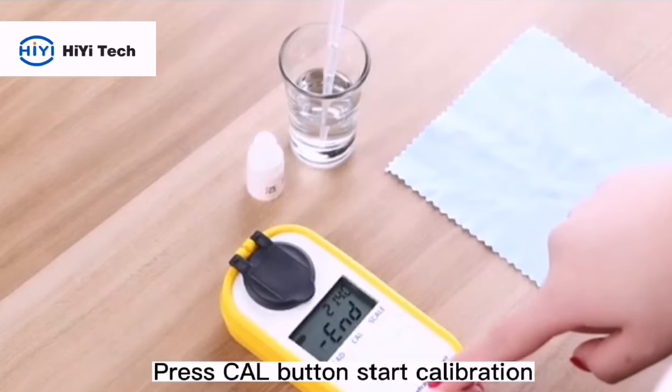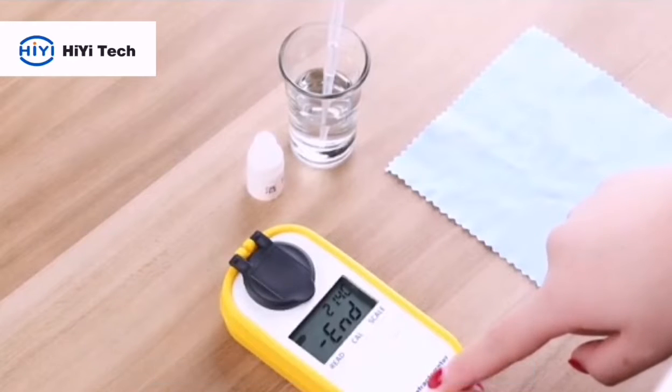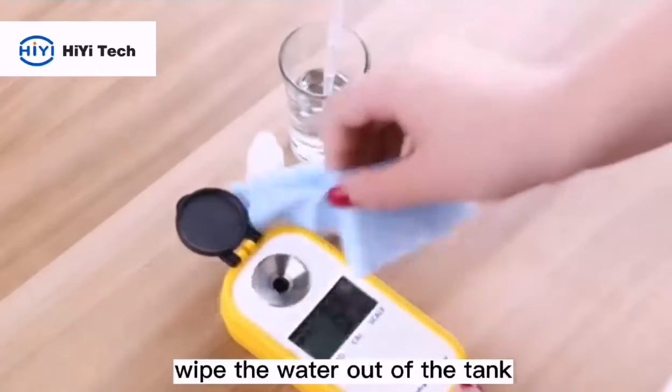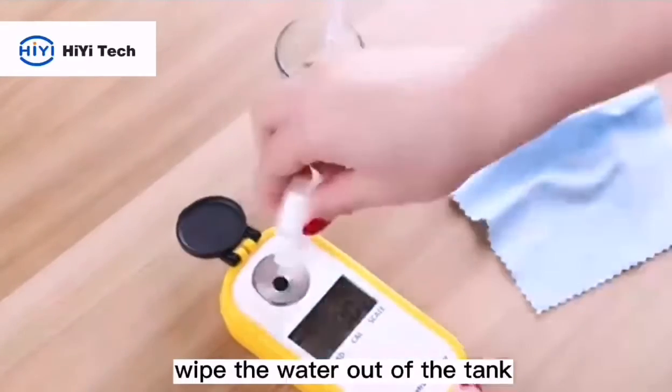Press the CAL button to start calibration. After the end of calibration, the screen displays 'end.' Wipe the water out of the tank.